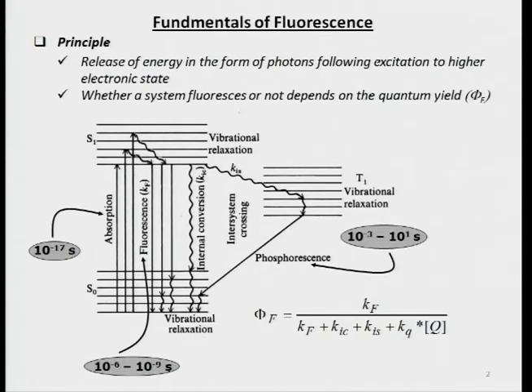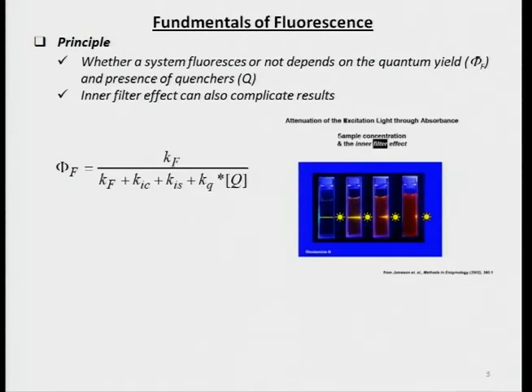So that's the principle. We have to detect photons released from the system. In addition to the thermal vibration and the temperature and the quenchers, there is also something in terms of the experiment that we always have to keep in mind, and that is the inner filter effect. The inner filter effect can also be a problem. So what is the inner filter effect? It is described here. Under normal conditions, we have to work with dilute solutions. We cannot really work with very concentrated solutions.